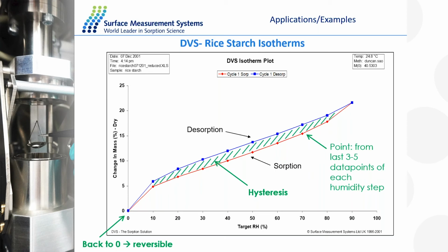And the other set of information that we can get here is that our material is very, very stable in the presence of water. In fact, we can do this cycle as many times as we want, and we can always go back to the initial condition of the material because there is no transition. So this is a very, very simple experiment.